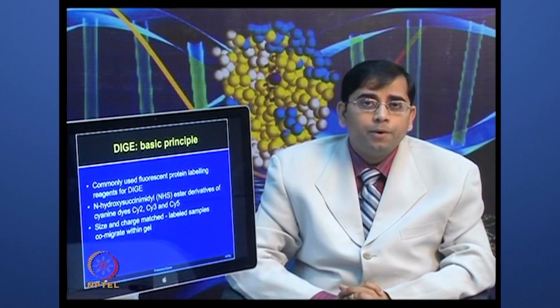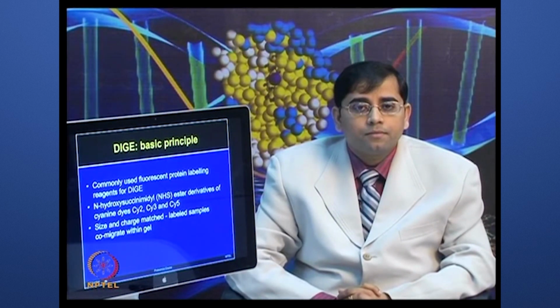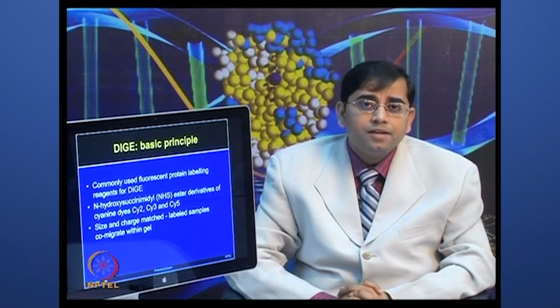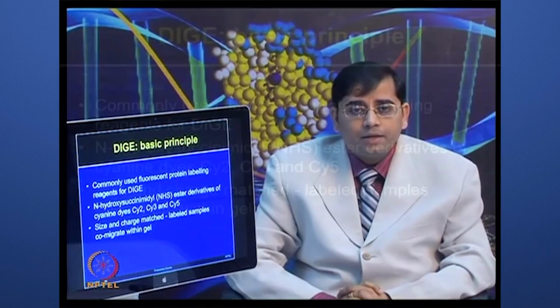So, let us talk briefly about the basic principle involved in DIGE technology. We have to discuss how to do the protein labeling, then what is the need for doing the internal standards. So, let us talk step by step.